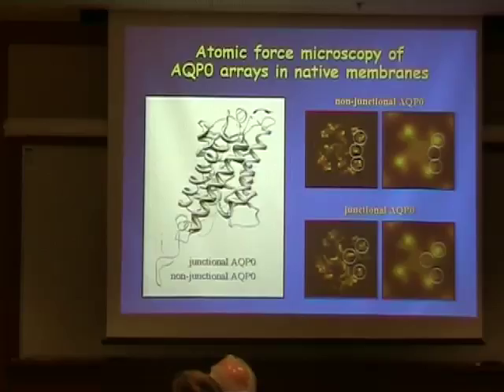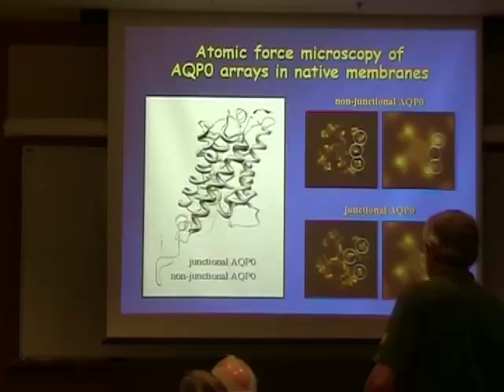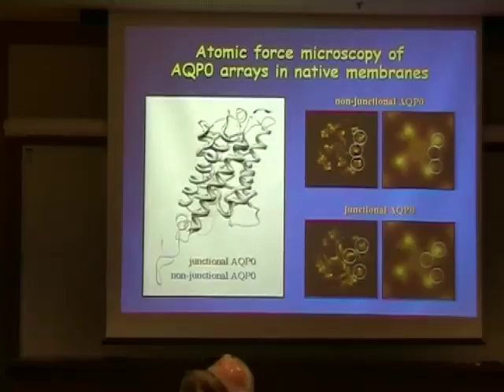It's a question concerning the crystals. Is the double layer important for this process? Yes, for the formation of the crystals, and for the resolution. We get better data because it's a double layer. First, you get a stiffer membrane, so you don't get as much wrinkling. And secondly, you have twice as much diffracting density in the same area, so you get much stronger diffraction spots.